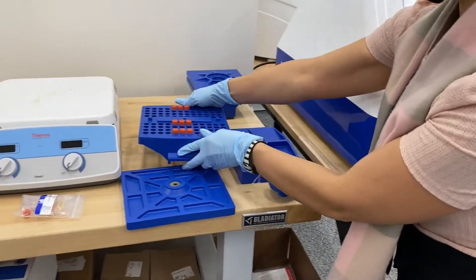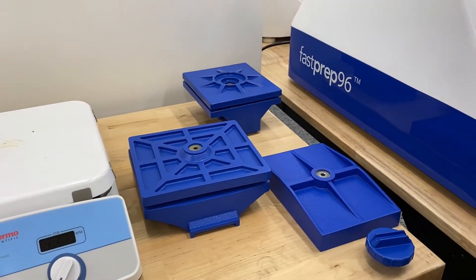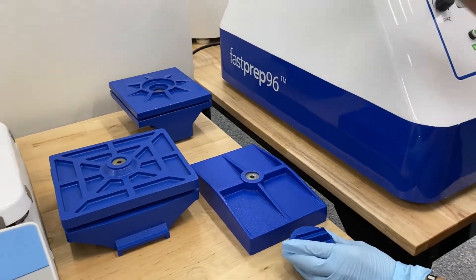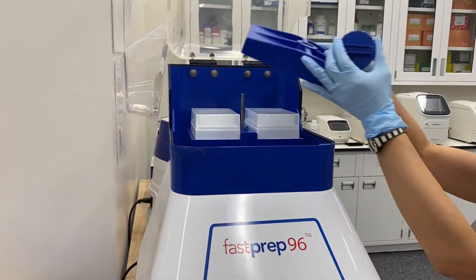Again, these can hold up to 96 of the 2 mil tubes. We would attach the 2 mil tubes, attach the sample holder, and replace this sample holder with the QuickFlex, as I showed you. What we have loaded is the weld plate that comes complementary with the FastPrep 96.